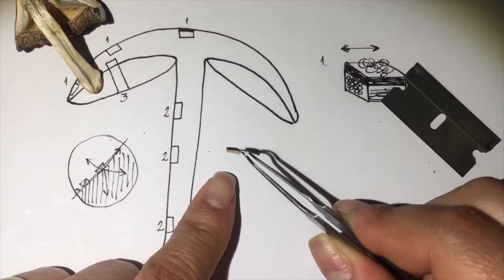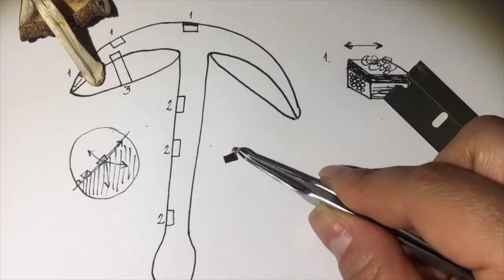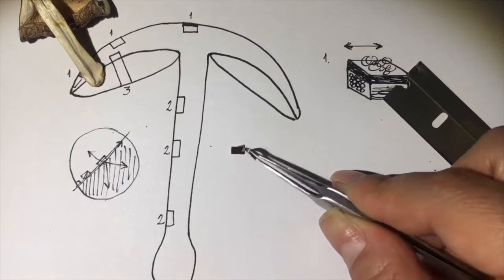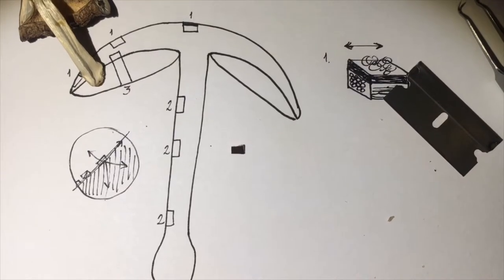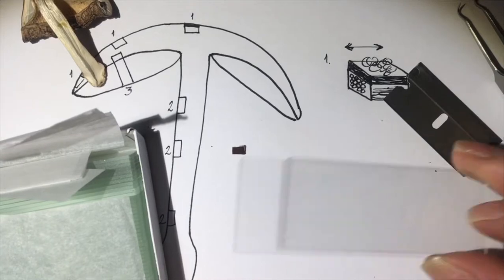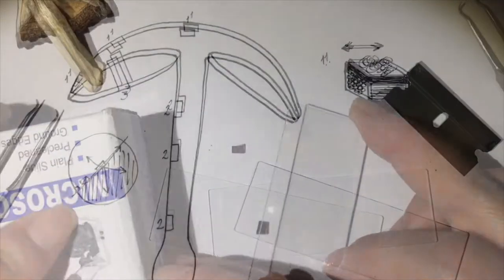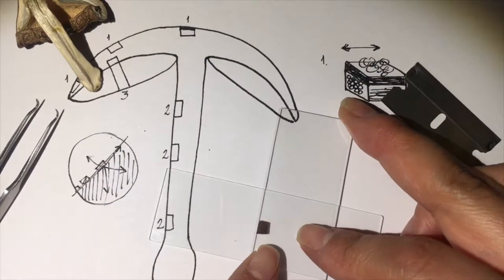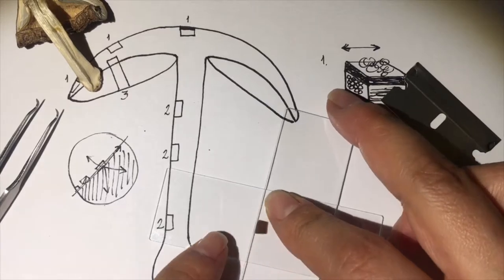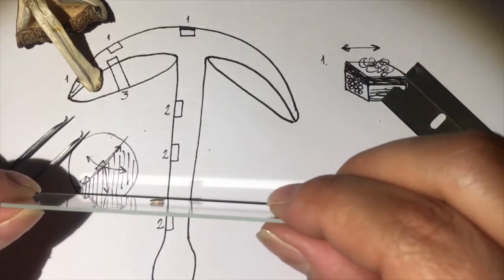So my trick, before I even hydrate it, I prefer to cut the tissue when it's still dry. You are free to try with hydrated material, but my sections are much thinner when I have not done anything to the tissue just yet. So the big trick here is you're going to use this like a cutting board. And this is almost like a finger protector. Press your material. I usually press it down first, sort of keep it as thin as you can get.